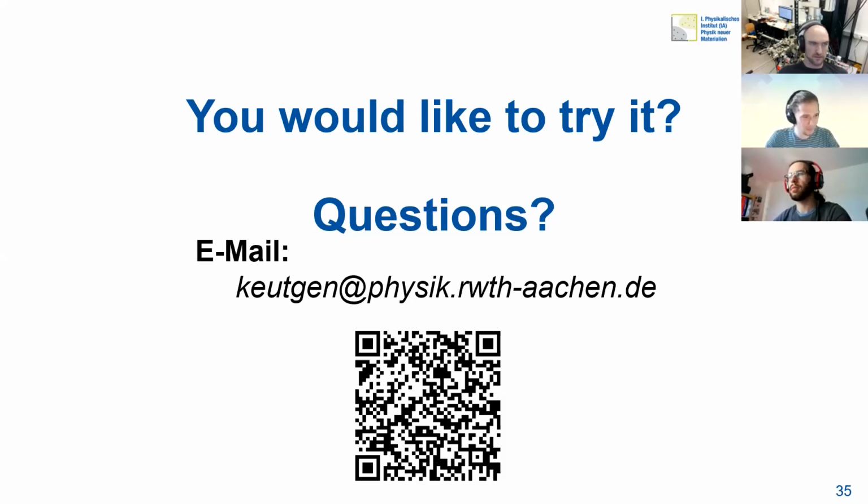Okay, so another question. For people in other laboratories, like the Stuttgart laboratories, or other people who are building their own equipment, how would you see them interacting with this software? If they want to interact, you just need the range file and the EPOS file. I saw that the people from Stuttgart can export EPOS files. So if they export their files, they can quickly import them into this software and use it.